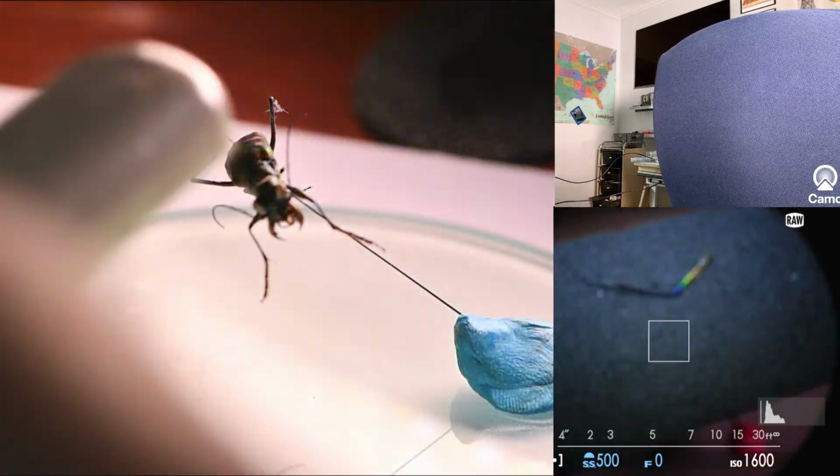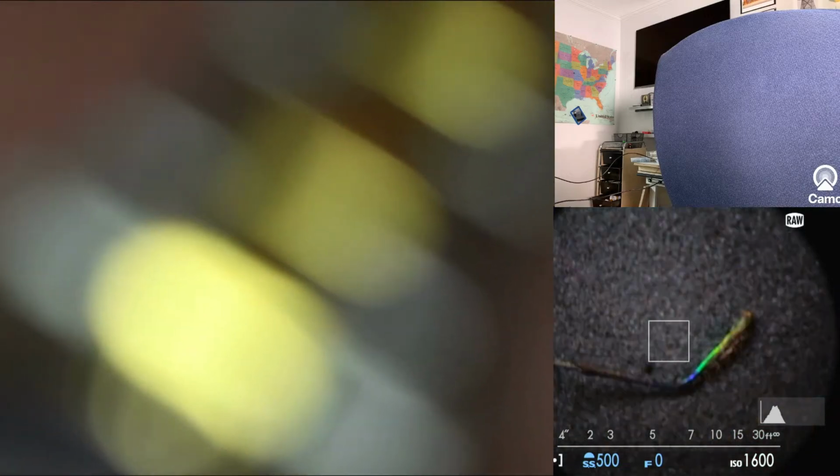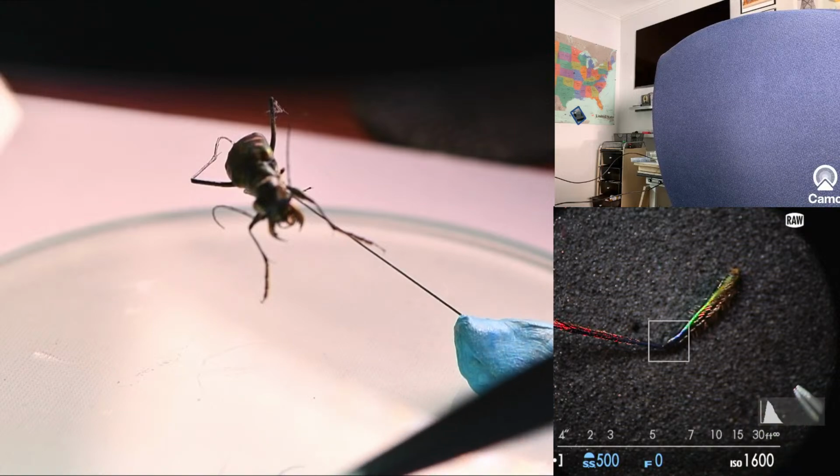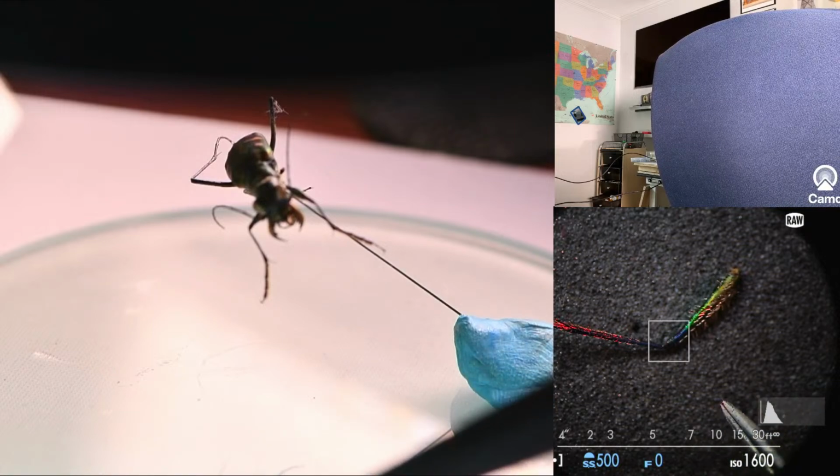So, let's get some more light on that. There you can see it. We'll try to focus a little better and zoom in. Beautiful, beautiful appendage. The colors are lovely, blues and greens, some red in there on the other side. I'm afraid you're getting some blinkies, but there ought to be a way to turn them off, but I haven't figured it out. So, a couple of things worth noting about this appendage that we're getting ready to re-implant.